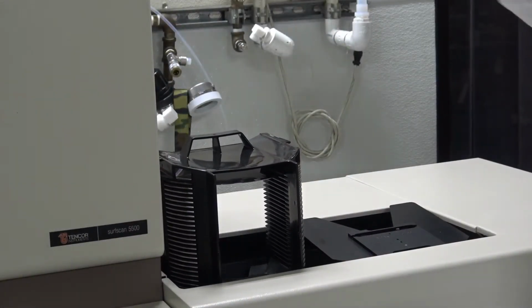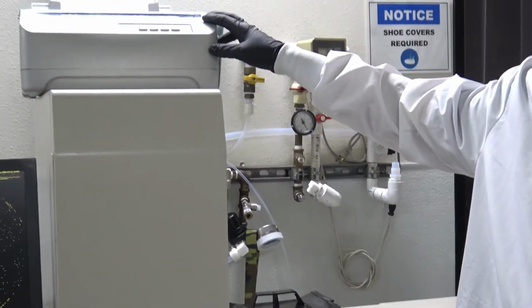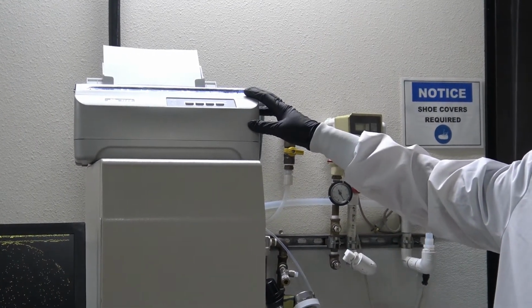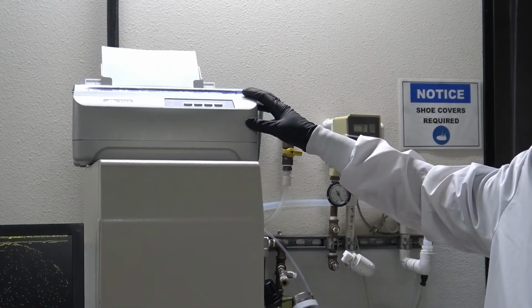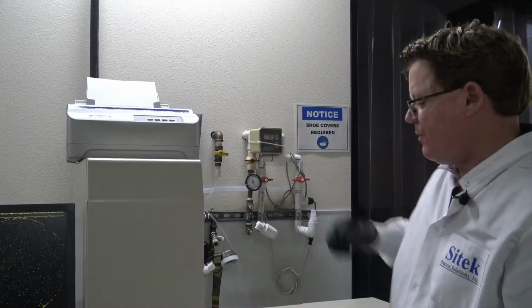On the last process, we have a printer included. The problem is the printer color is out. We have ordered new color modules, print ribbons, and these are being FedExed directly to the customer in Arizona for money delivery. But we can do a printout in black and white, which I'll show you on the print after.